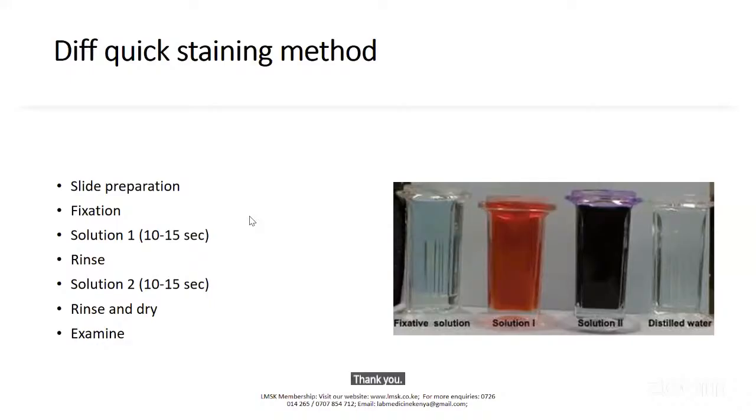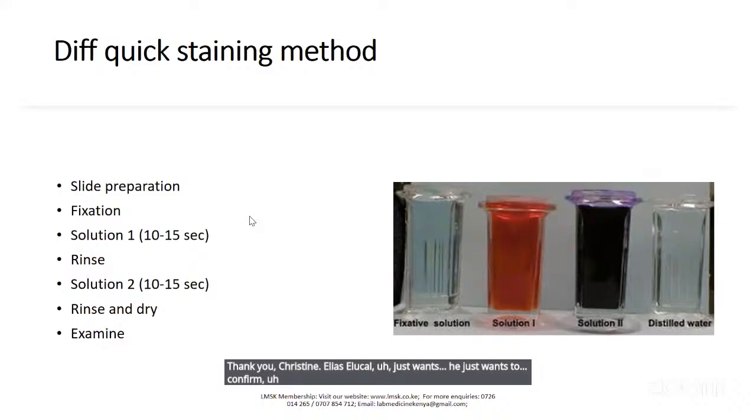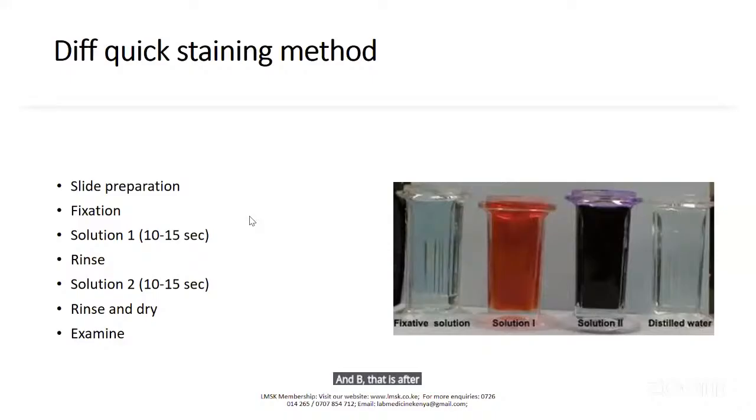Thank you, Christine. Elias Elukol just wants to confirm, do we use normal running tap water or distilled water after solution A and B? That is, when you want to wash from solution A going to solution B. From what is on the screen, you can see we are using distilled water. But if you don't have distilled water, don't kill yourself. You can use normal water.